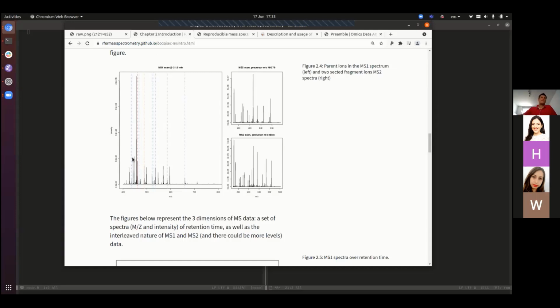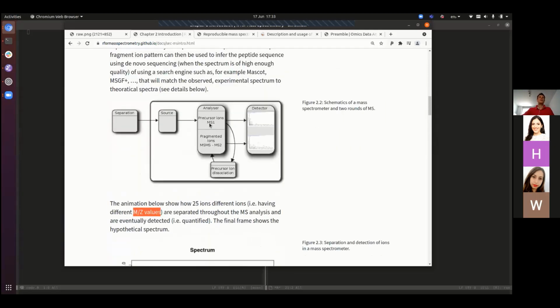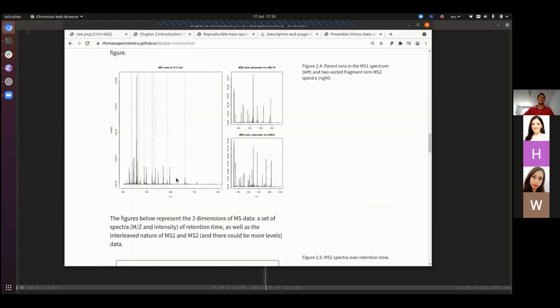So what happens to be able to characterize that peptide more specifically? That's what's illustrated here on my figure. All these individual peaks are called precursor peaks. That's the peak of the peptide. What's going to happen, automatically and very quickly in the mass spectrometer, is that a specific M over Z region is going to be selected around the M over Z value of interest.